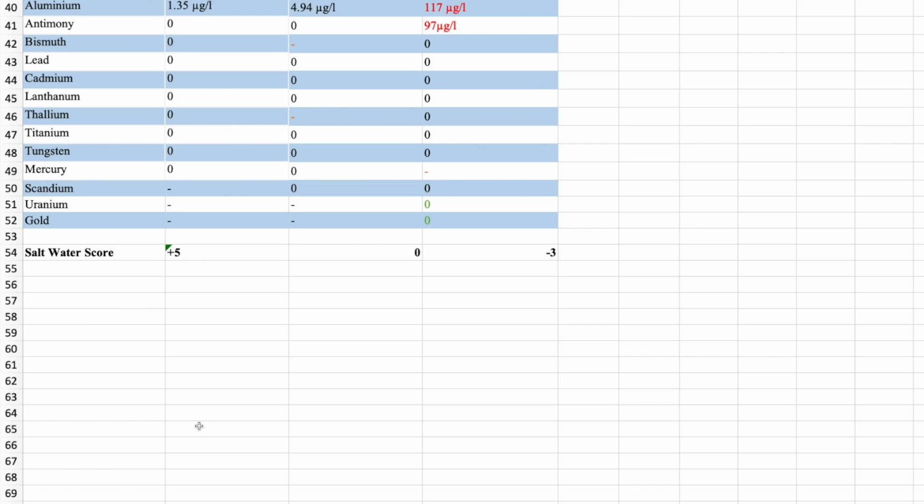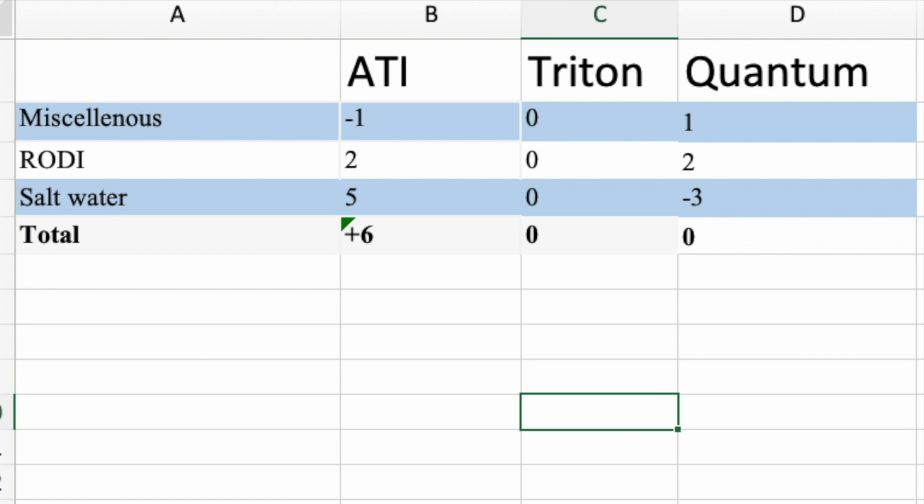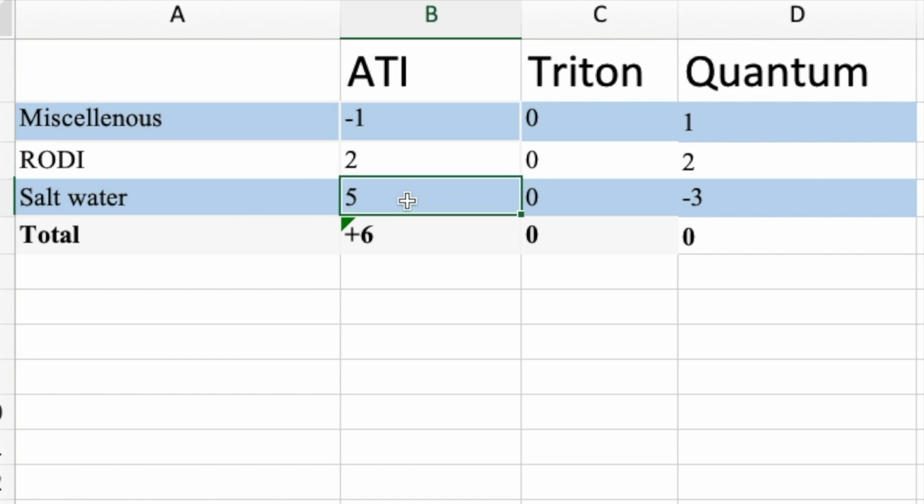I'm not sure, we've been recording for a little while now, but if you can't remember the scores from the other two tabs, I'll bring you over to my totals table, where I've got ATI went back a point on Miscellaneous. If you remember, that was because it took quite a long time for the results to come back. They got 2 points for RODI, mainly because they do an RODI, and the results were consistent with the Quantum one. On the saltwater tab, they scored quite a few points. Some of those, make your own opinion whether it's actually necessary or not, if some of those values you didn't need. But it does put them on a total of 6.